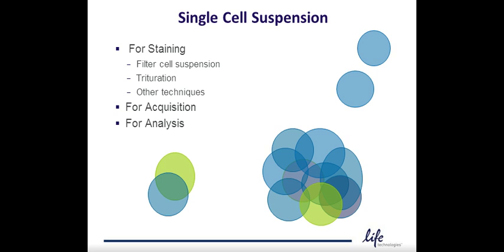You can also remove or decrease the calcium concentration in the suspension buffer. You can also try adding a bit of trypsin. Remember that sample processing for a particular cell or tissue should be optimized, and different recoveries and CVs may be obtained dependent on how sample processing is done.